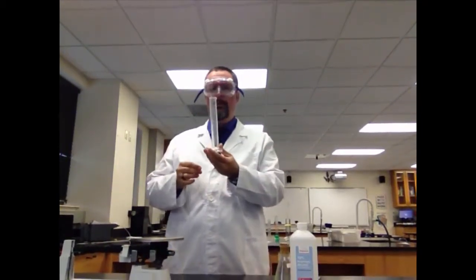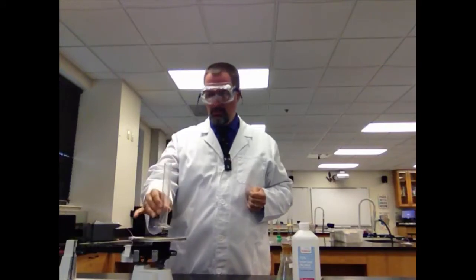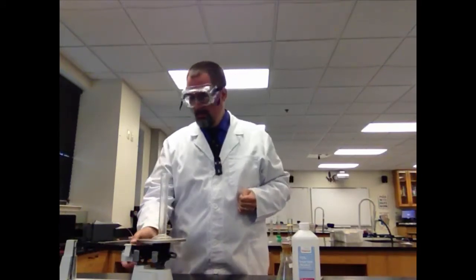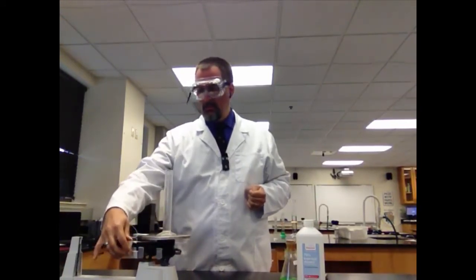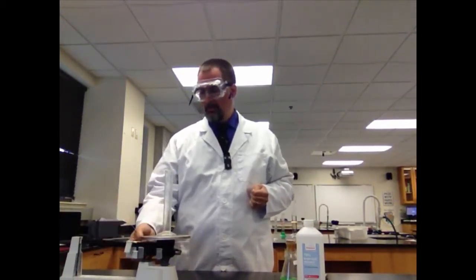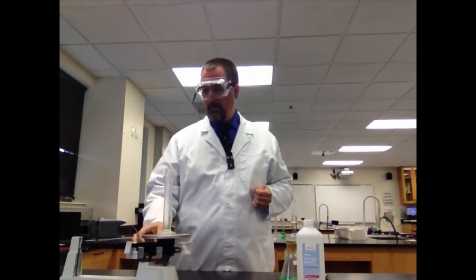The first thing you want to do is get the mass of the empty graduated cylinder. So you'll put that on the balance, and you'll move the sliders in such a way that you can get the mass of the empty graduated cylinder. For the sake of our trial here, it looks like it's going to be a little over 20 grams. Write that down in your lab notebook, the mass of the empty graduated cylinder. Make sure this is clean and dry before you go ahead and do this. So if you need to dry it out, that's fine.